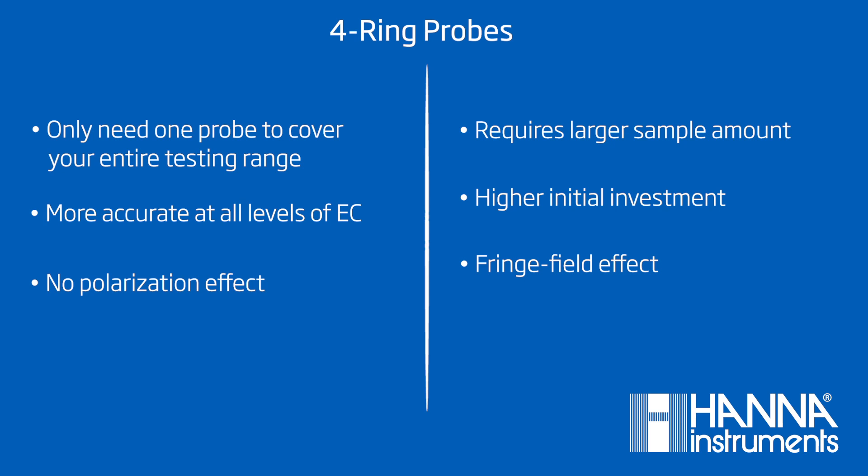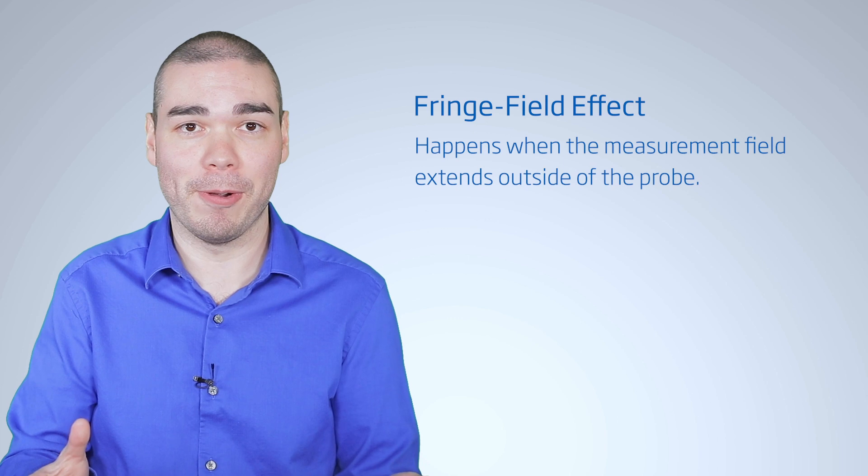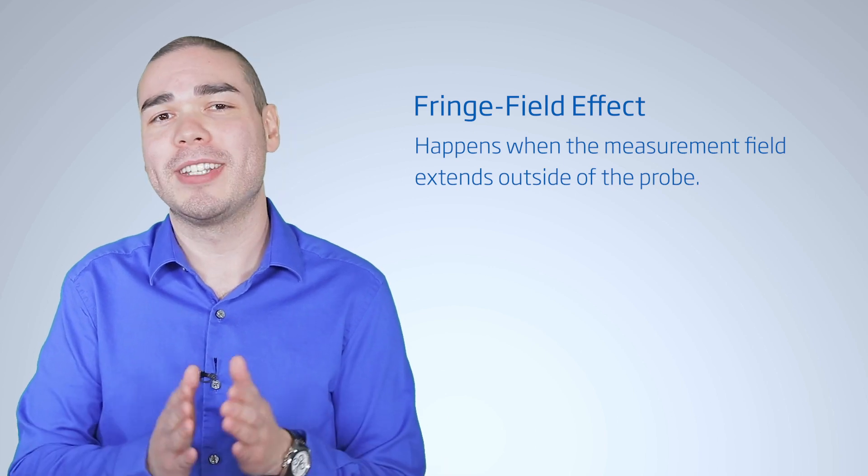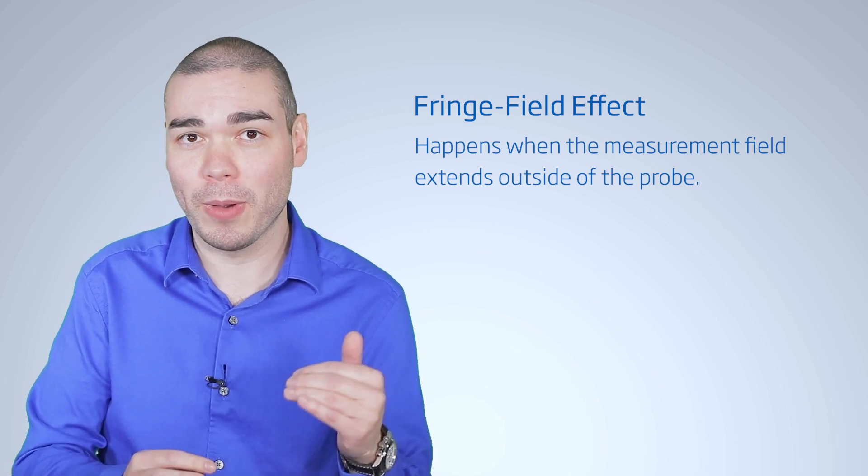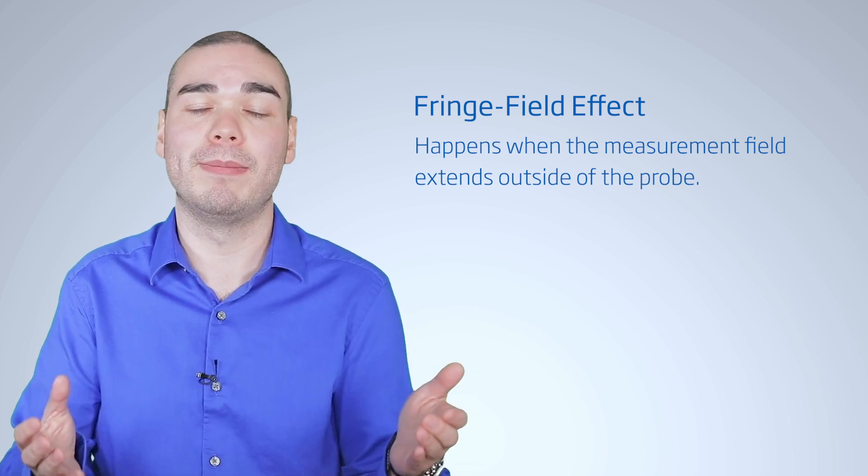For the four-ring probe, you will have to use a larger sample volume to adequately submerge the probe, and it is more of a financial investment. While you don't have to worry about the polarization effect, you do need to be wary of the fringe field effect. This happens when the measurement field, that constant current, extends outside the probe. You only need to worry about the fringe field effect if your probe is too close to the sides of the container, or pipe, where you are taking an EC measurement. A good rule of thumb is to keep the probe at least an inch away from all surfaces. The distance you need to keep the probe varies, so just check your manual.